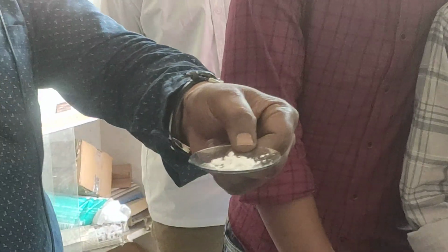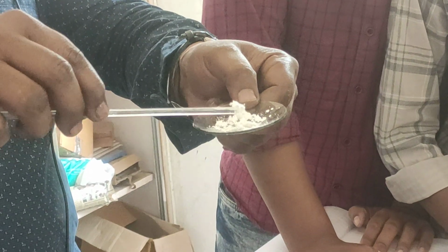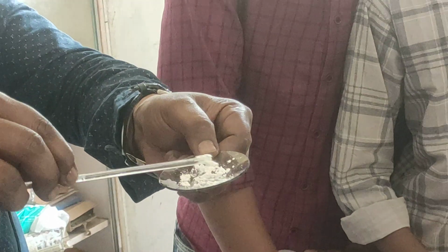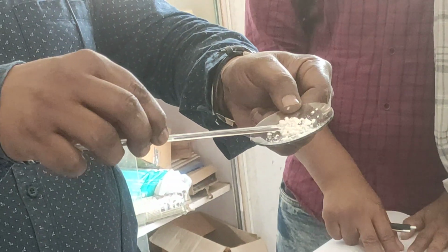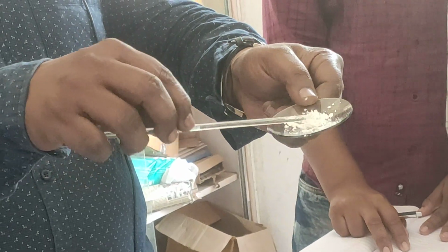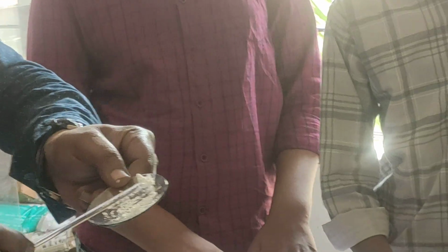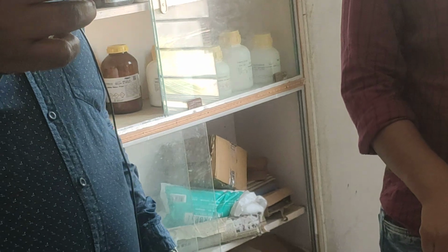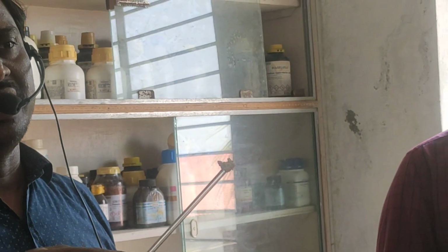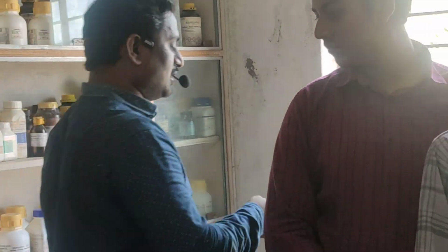Be careful with the concentrated acid. Make a thick paste like this. This thick paste you have to bring near the flame. So now I am bringing it near the flame. You will get brick red. Calcium is confirmed.